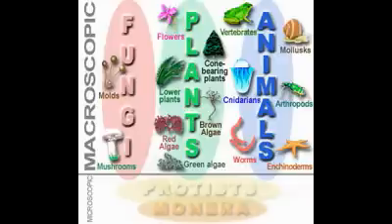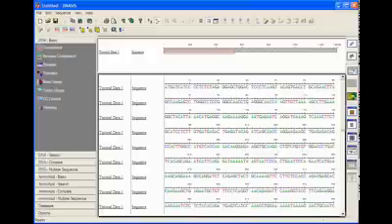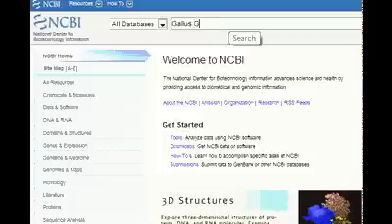This basic process can be used the same way to extract the DNA from the tissue. It could be any tissue, but it needs to be the same tissue, or it works best if it is the same tissue. Once the whole genome DNA is extracted, the next process would be designing a primer for a specific area. And that goes back to the NCBI website, which can be very helpful if you want to look at a specific gene or a specific area on the DNA.